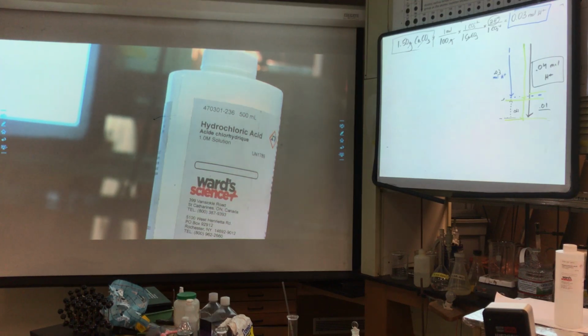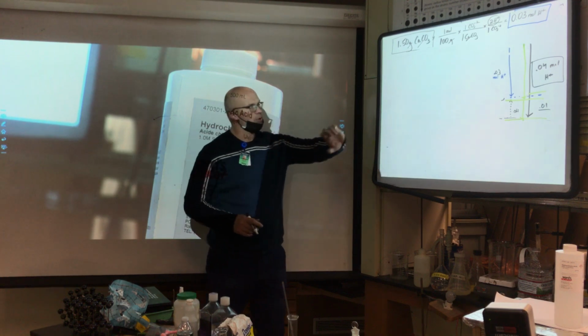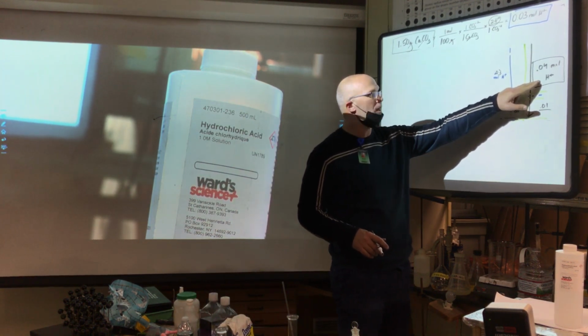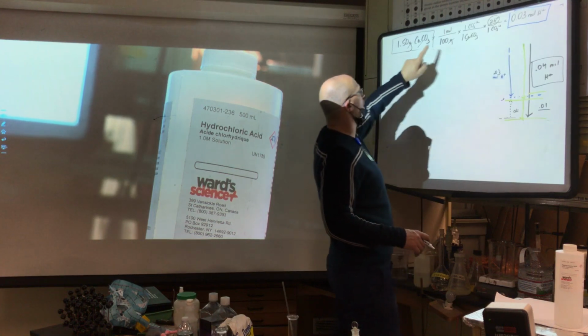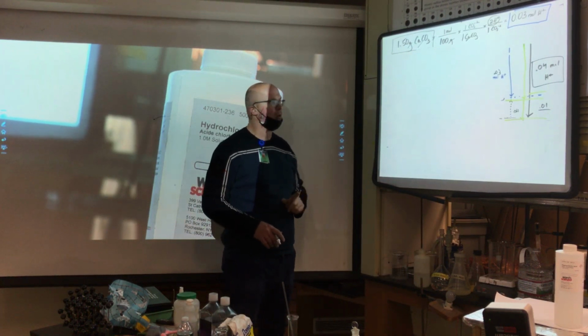All right, so we're talking solutions. This is a really important part of the procedure. There were two important solutions. We decided to add 0.04 moles of H+ that would shoot past the target of 0.03 moles of H+ needed to neutralize our 2 tablets of 750 milligram calcium carbonate.